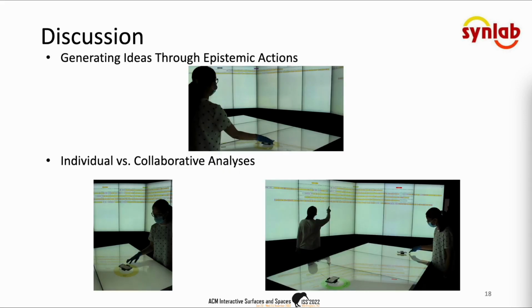In the end, Tangible Chromatin allowed high-value idea-generating observation of patterns that would otherwise be lost to aggregate averaging. There was some indication that the support for epistemic actions was helpful in generating unique or valuable ideas. This is consistent with research that has studied how epistemic actions reduce cognitive load in problem solving tasks. Our work takes a step in this direction.